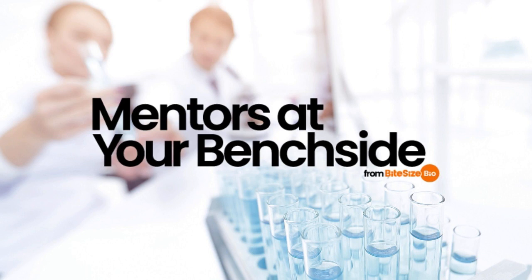Drumroll, please. So now we're going to give you 8 ways that you can improve your accuracy and precision in the lab. Tip number 1, keep everything calibrated. Calibration is the number 1 item on the list for a very important reason. It is the most critical means of ensuring your data and measurements are accurate.